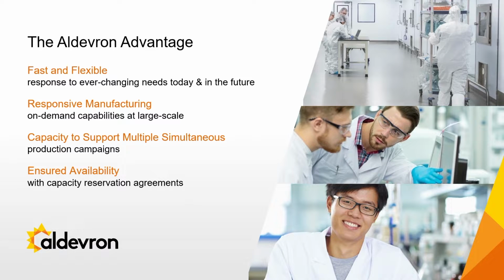So that's a great question. We worked with AAV. AAV was the one that came along that had ITRs, which are inverted terminal repeats. And we had the same problems everyone else has with terminal repeats. But then we developed, which I didn't talk about here, the Reviver host cell line. So we developed a high yield manufacturing cell line that allows us to deal with structured DNA. And so we use that for all our messenger RNA vectors, very stably and high yield produced, like a poly-A vector, and we use it with all our AAVs for the ITR. GC, we really haven't had a problem with that per se, but yeah, we did have to develop a modified strain to be able to handle poly-A and ITRs.